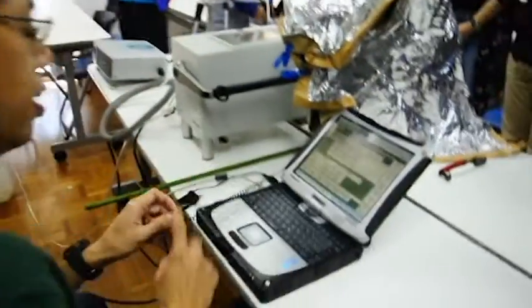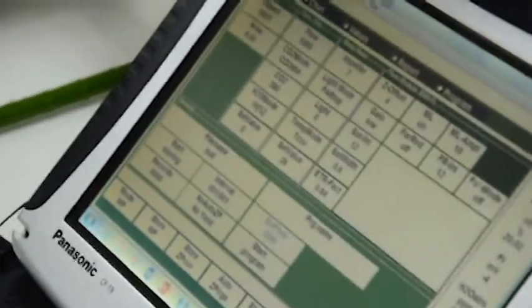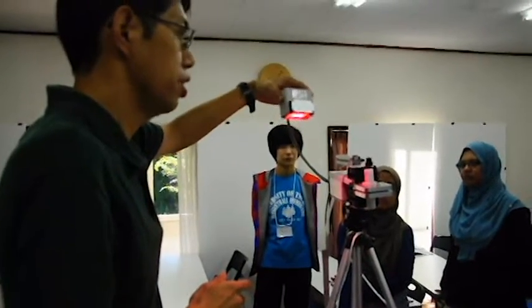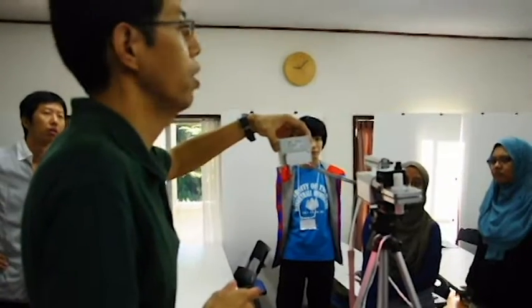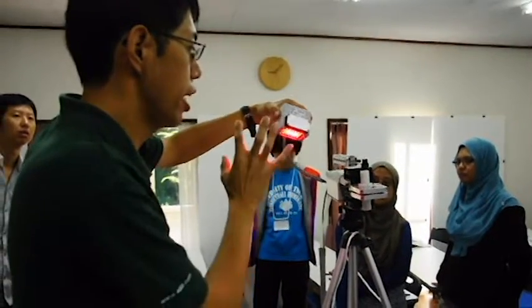Okay. For example, now the flow rate is 750. From now I increase it. And now the intensity is 500. 500 is around the level before noon on a cloudy day. Not so strong. Yes. And this is the LED light.